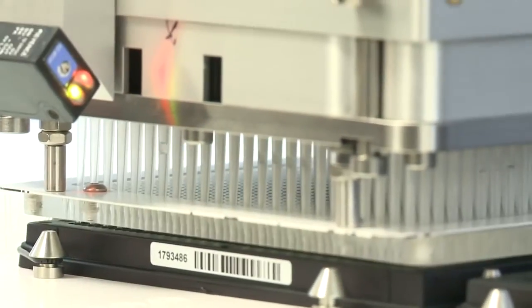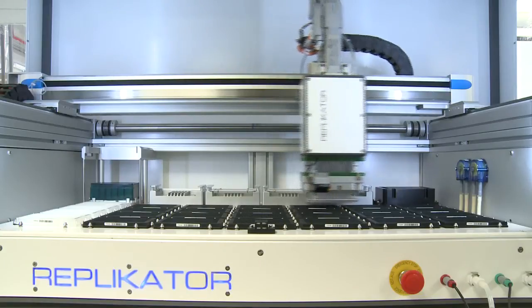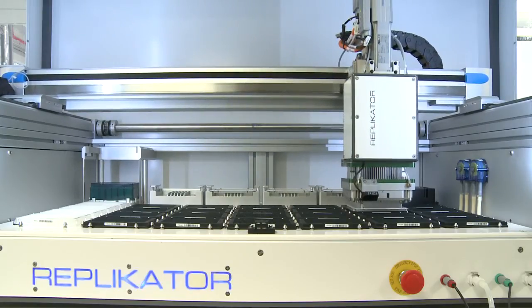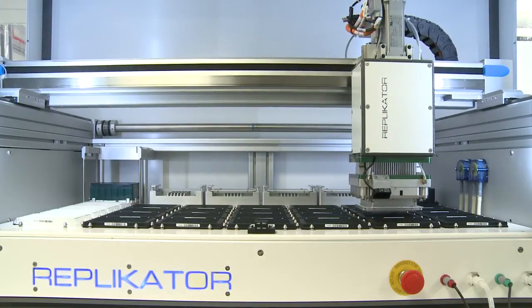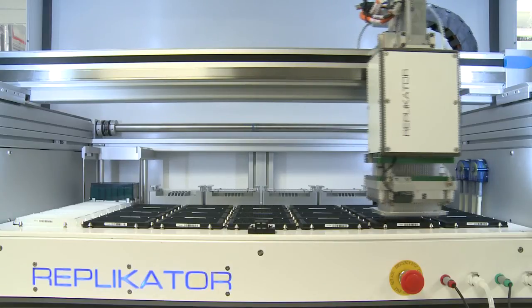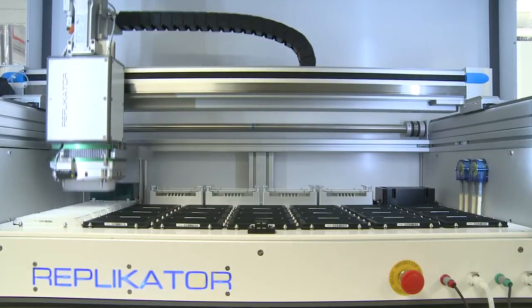Operation is simple and can be adjusted to suit your application from the standalone control software. Plate size, heights and well locations can easily be programmed and adjusted to suit the way you work. Once done, Replicator will map across the entire deck now all the locations are known, whether you're using SPS standard or custom plate dimensions. There are no real limits.